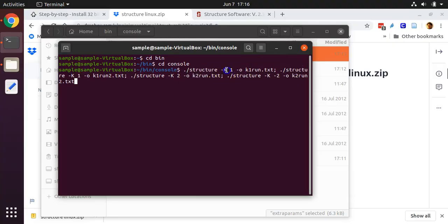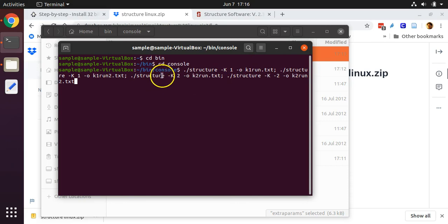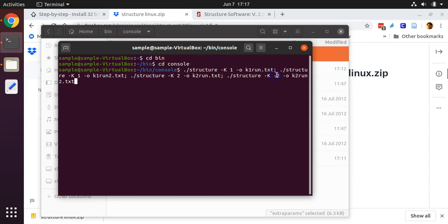And for each one of those scenarios, we're doing two replicate runs. There's the first replicate run, there's the second replicate run. For two inferred ancestral groups, there's the first replicate run, there's the second replicate run.